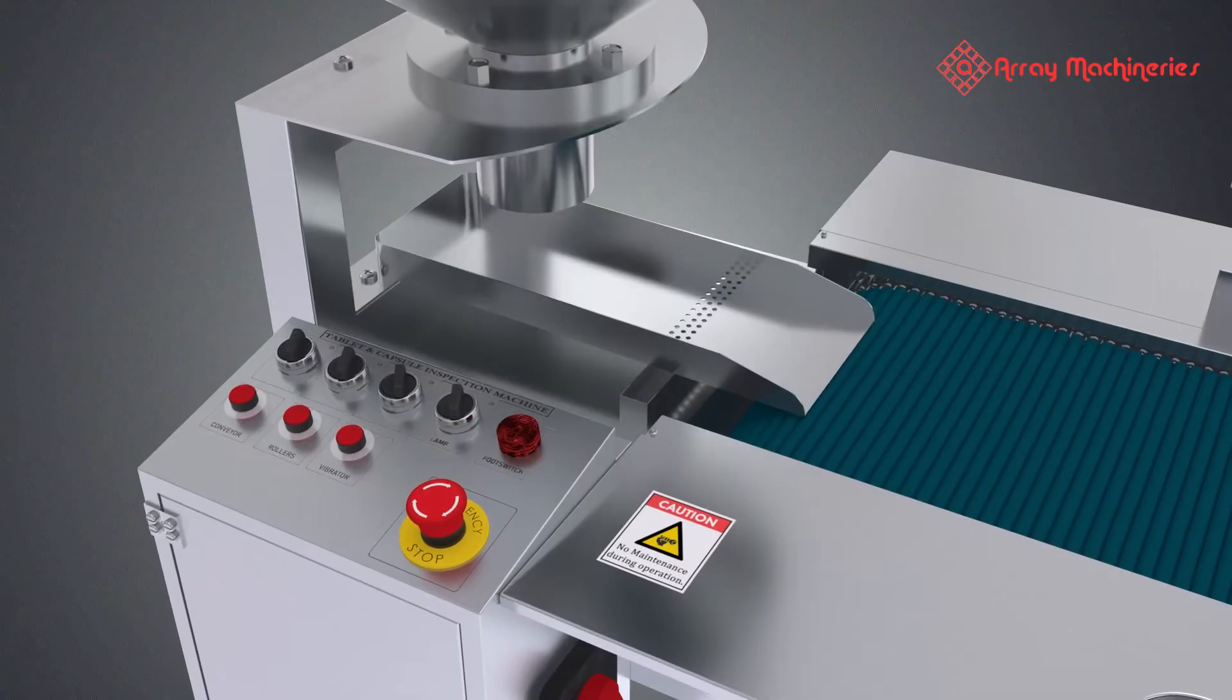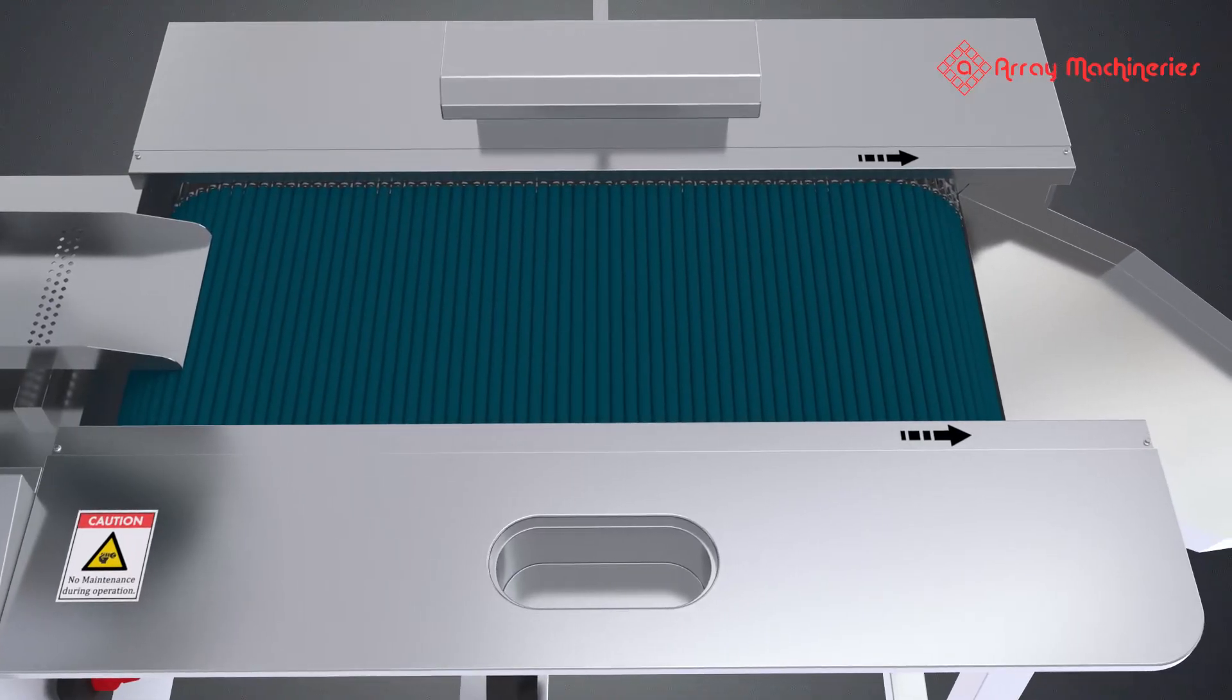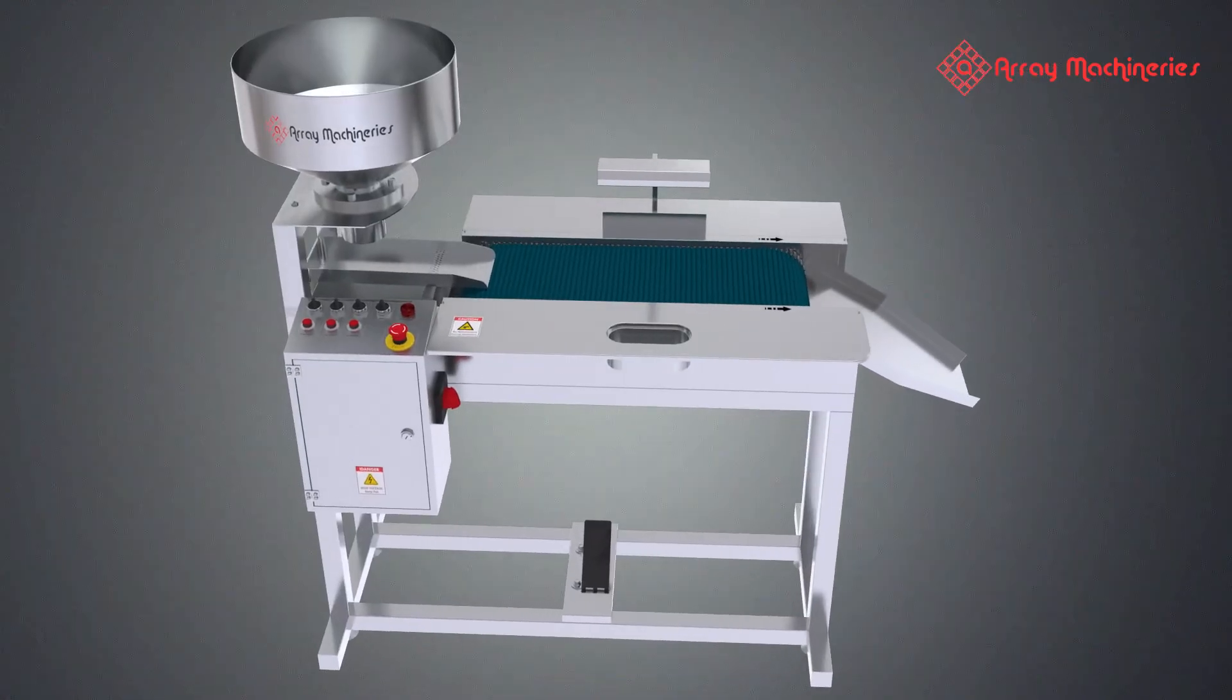Array Machinery's Tablet and Capsule Inspection Machine is used for visual inspection of defects in both tablets and capsules.